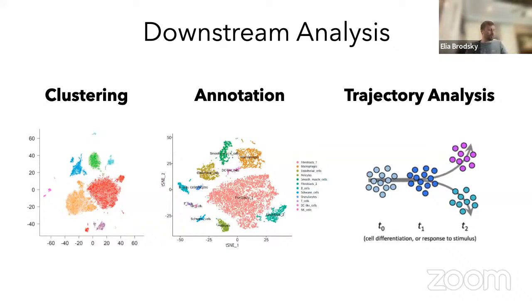So for clustering, one of the major challenges is what do I call similarity, right? These are going to be heterogeneous samples, and so I have a lot of variation just at the level of expression. I have a lot of variation inside specific genes at the level of expression. And now when I try to find differences or similarities, I have, again, tens of thousands of cells here, right? So it's very difficult to work with such complex data.